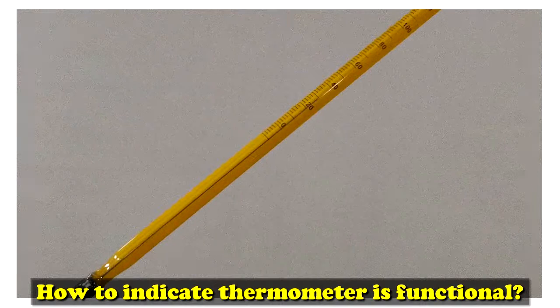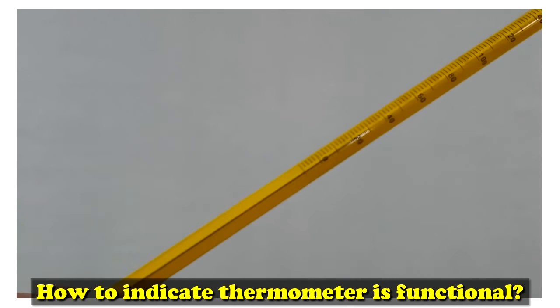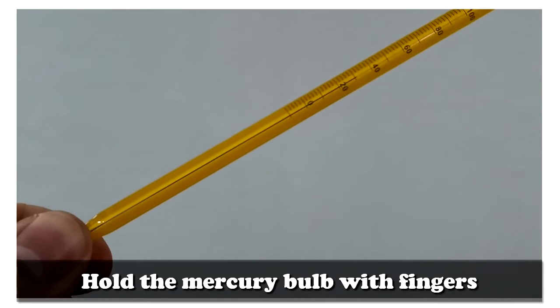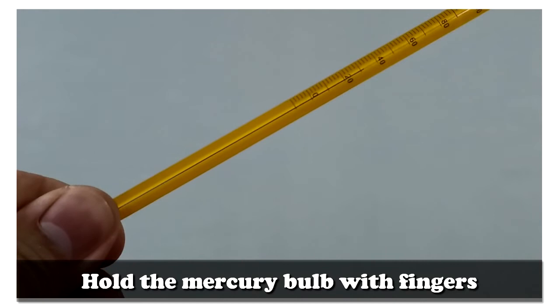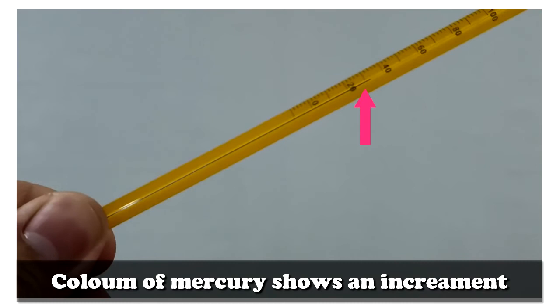How to indicate the thermometer is functional? First, hold the mercury bulb with fingers. Make sure that column of the mercury shows an increment.